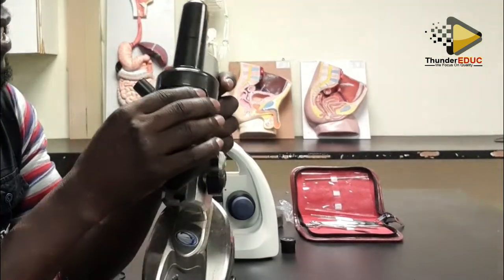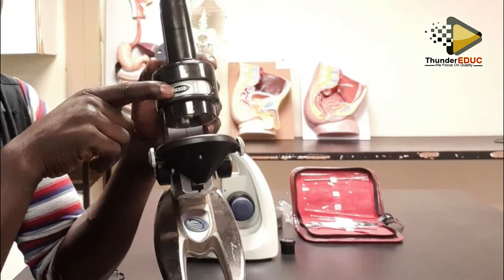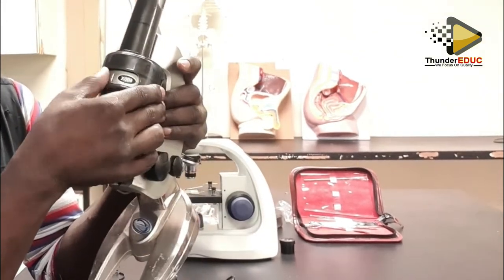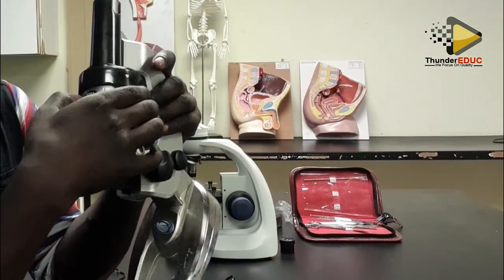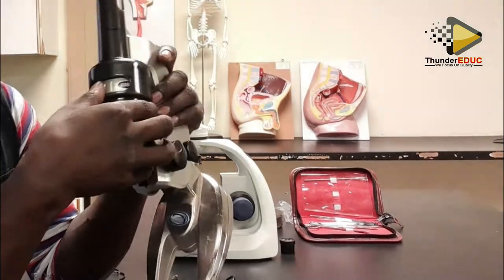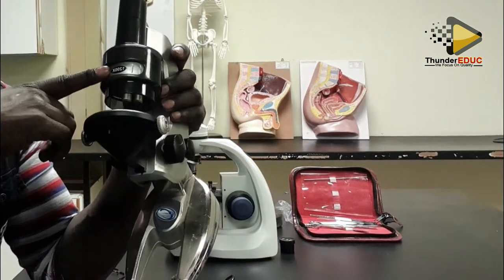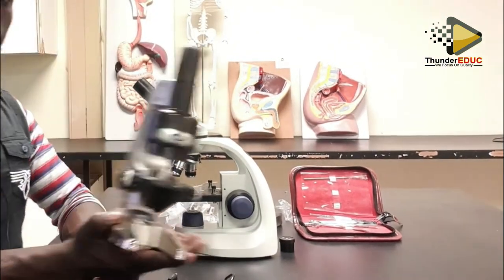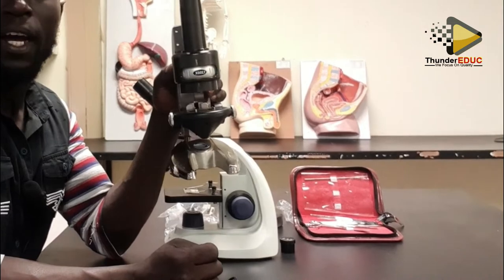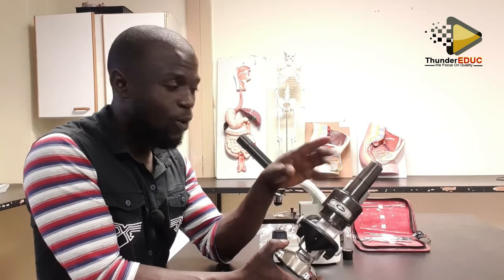You see, once I turn like this, the magnification will be 600 times. Then if I turn this, it is 100 times. If I turn this, it is 1200 times. So you can see it like this, and it can magnify. Yes, it's a compound microscope because it has one lens, two lenses. Because it has more than one lens, it is a compound microscope.